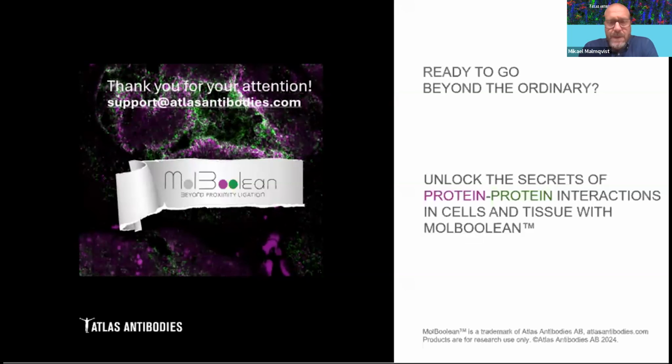Okay. There's a question here: can we use this for looking at RNA-protein interactions? For example, if the RNA FISH probe is labeled with digoxigenin and the antibodies used are against anti-dig, which is the RNA then, and perhaps an RNA binding protein. In other words, is the protocol compatible with RNA FISH? Thank you.